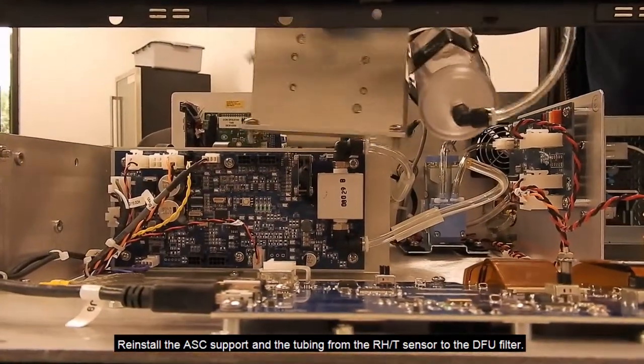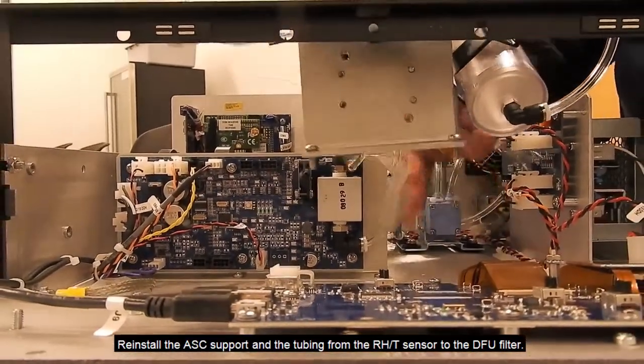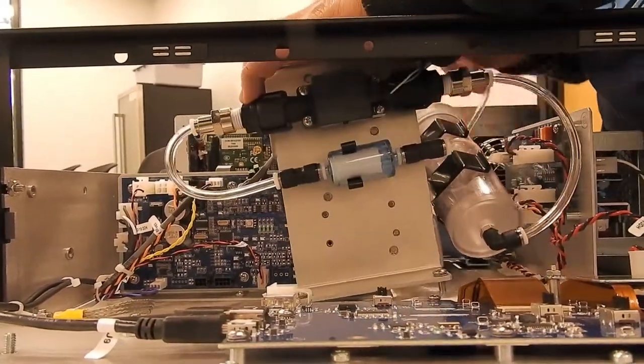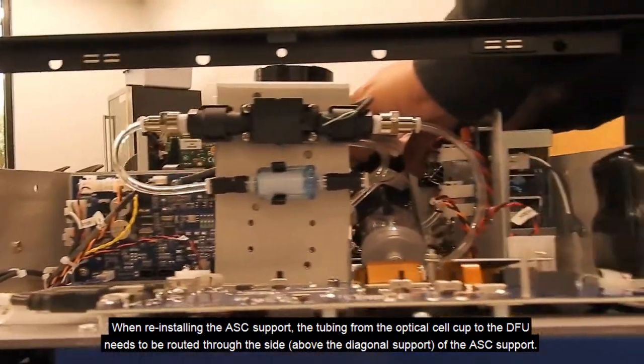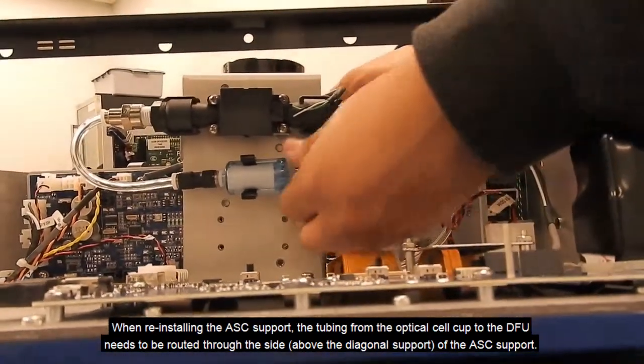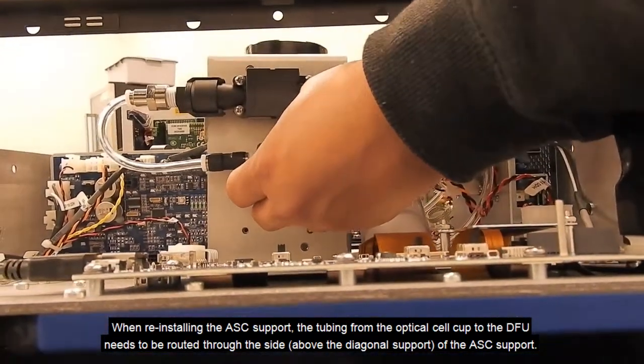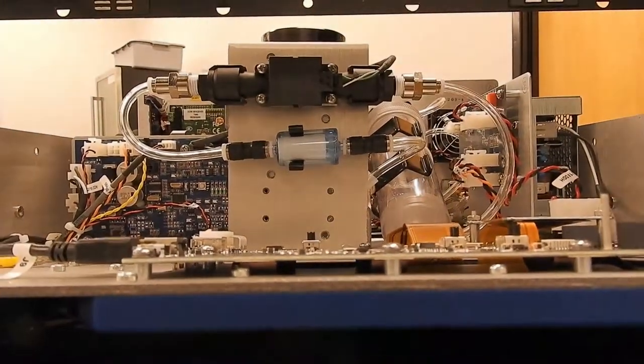Reinstall the ASC support and the tubing from the RHT sensor to the DFU filter. When reinstalling the ASC support, the tubing from the optical cell cup to the DFU needs to be routed through the side, above the diagonal support of the ASC support.